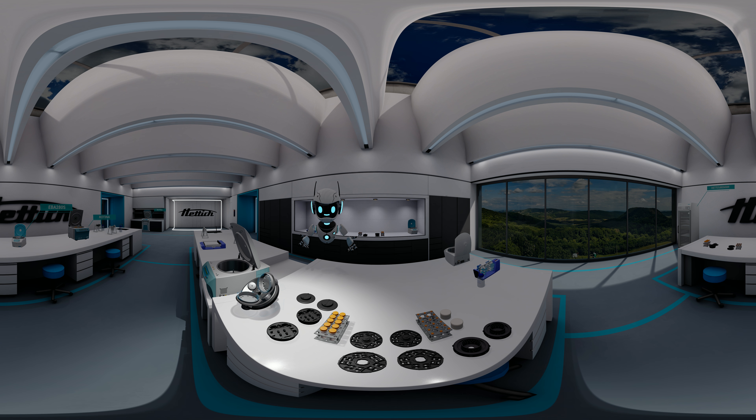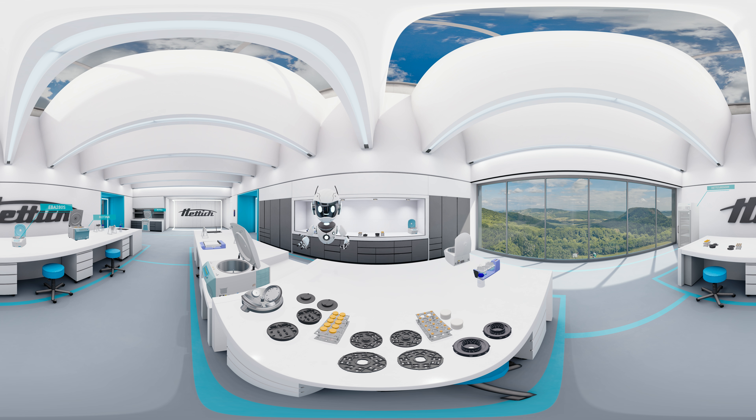This is the patented Zentromix rotor, the heart of the new Zentromix device. This completely new type of rotor is equipped with two additional rotation units, which rotate separately during centrifugation. Sample vessels fixed in these units are forced to rotate around their own axis, which causes high-frequent and tremendously fast movements of the sample material in the vessels, which is the basis for highly efficient extraction, milling, mixing, or homogenization of the sample materials.